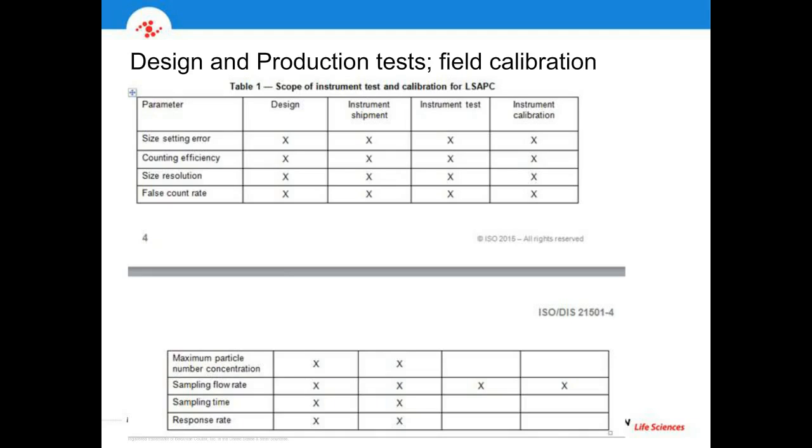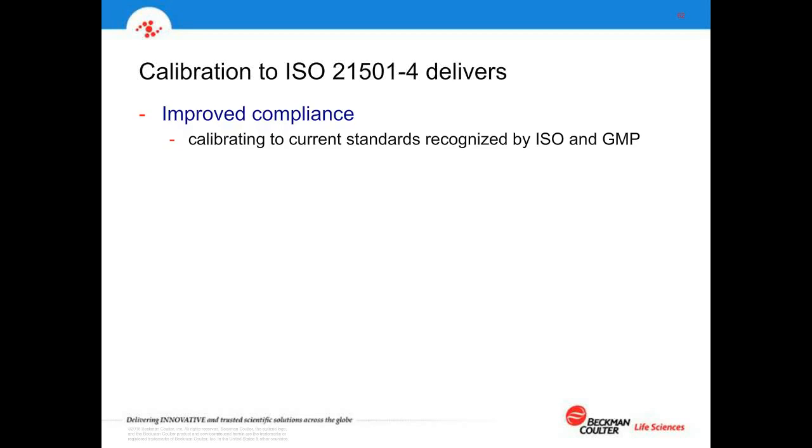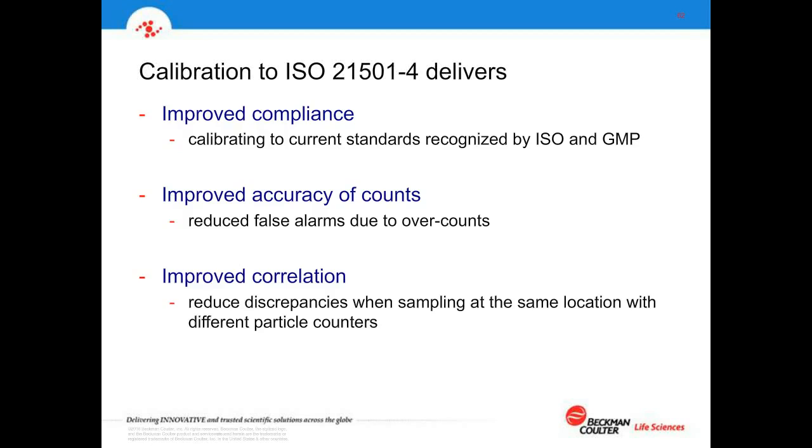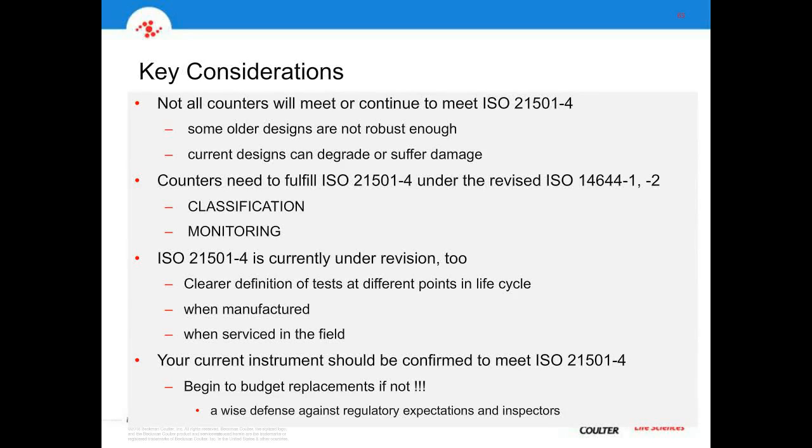So this is one of the discussions that's coming up in 21501. So basically, as a summary, 21501 delivers better compliance, better accuracy of counts over the lifetime of the instrument, and improved correlation of counts between two different instruments.